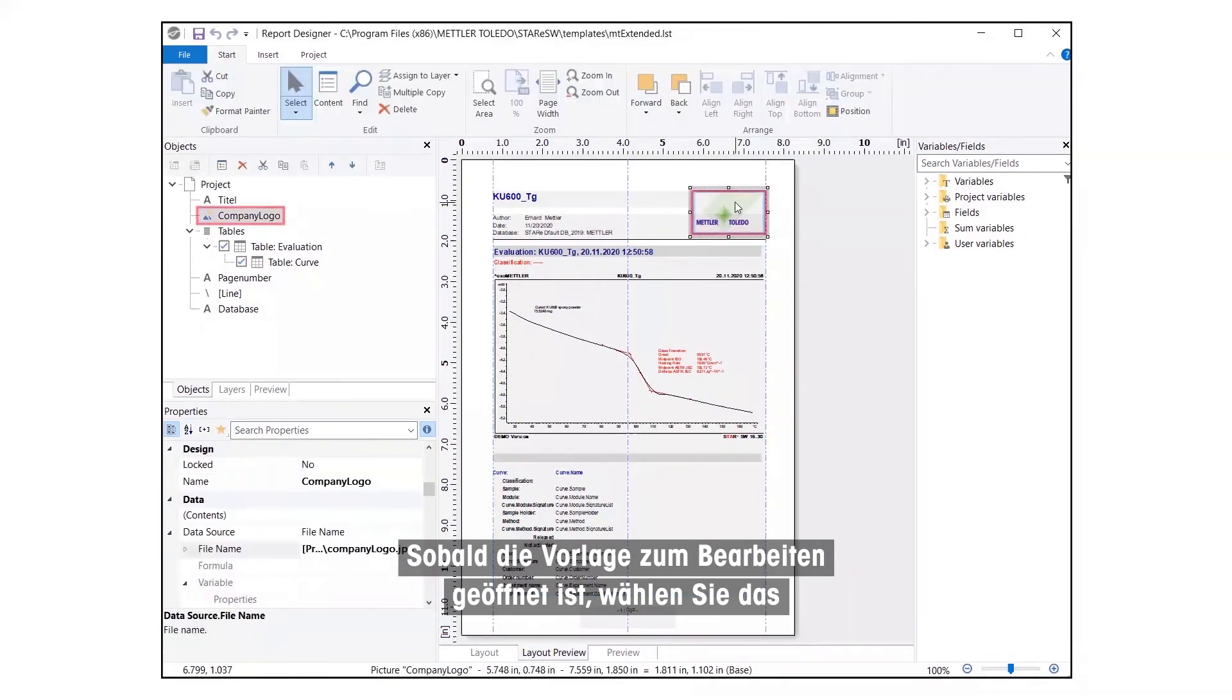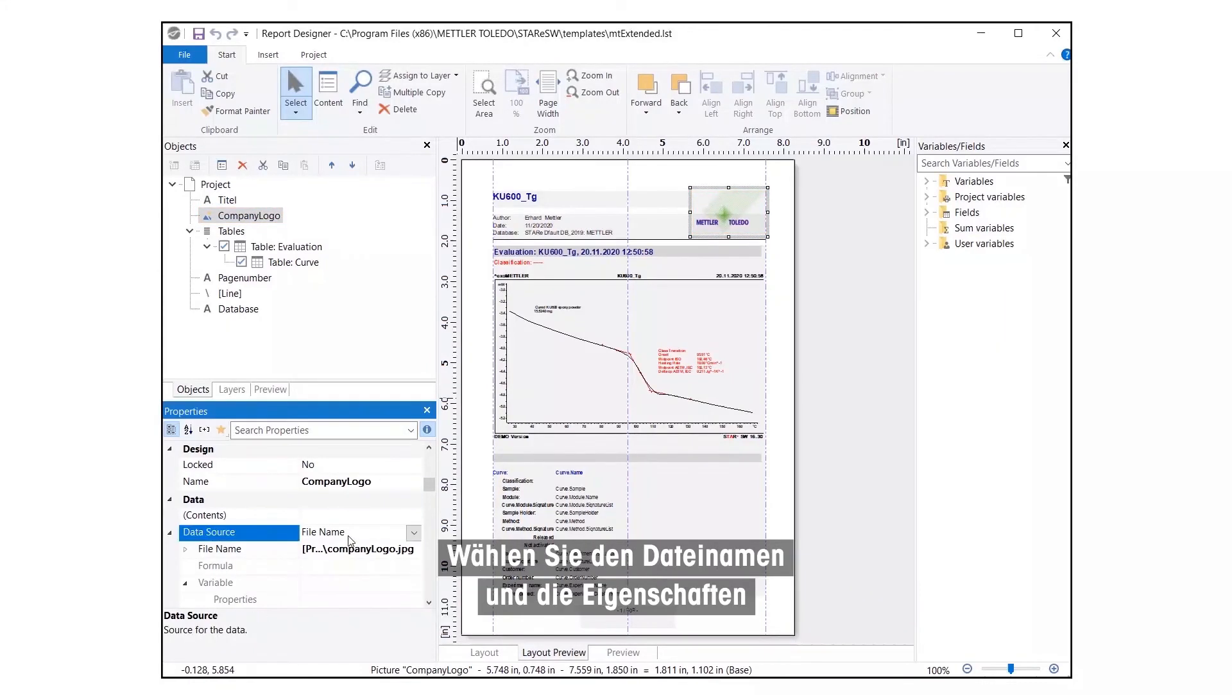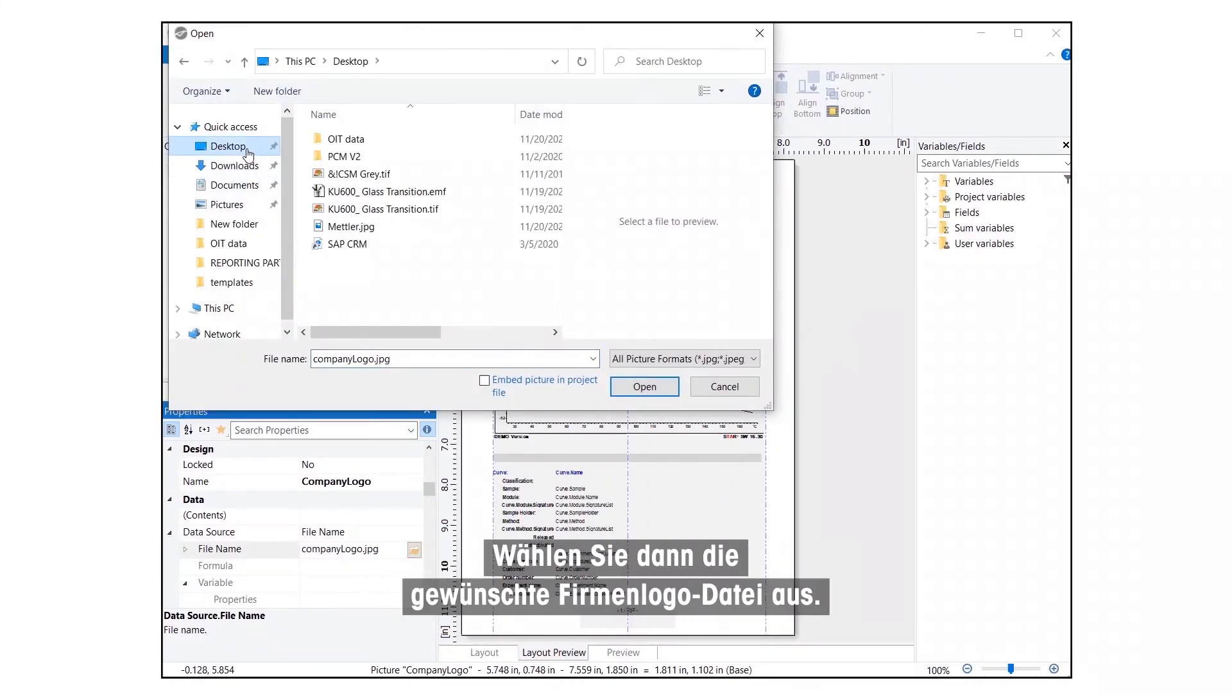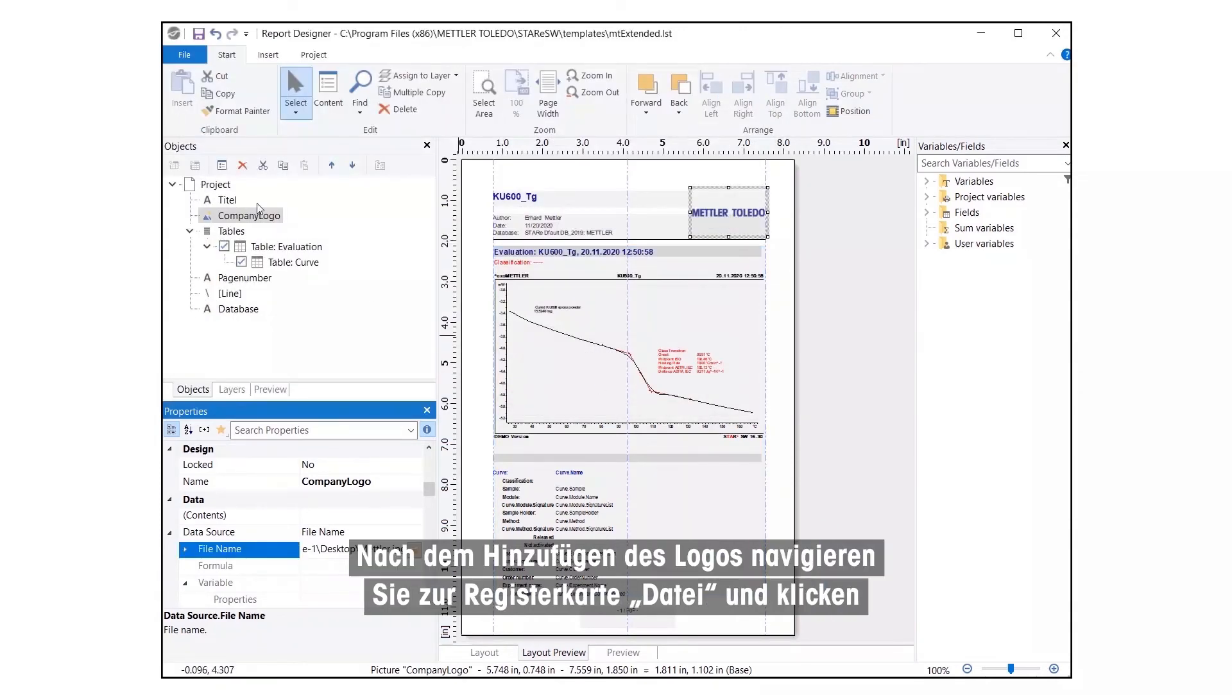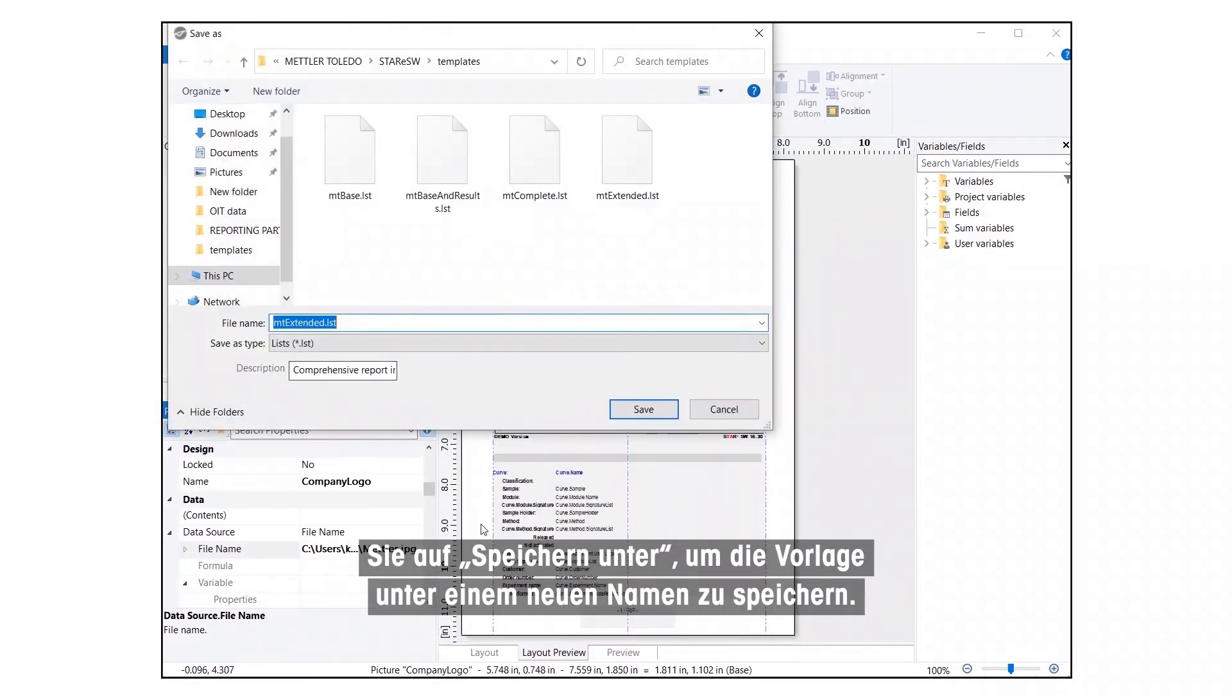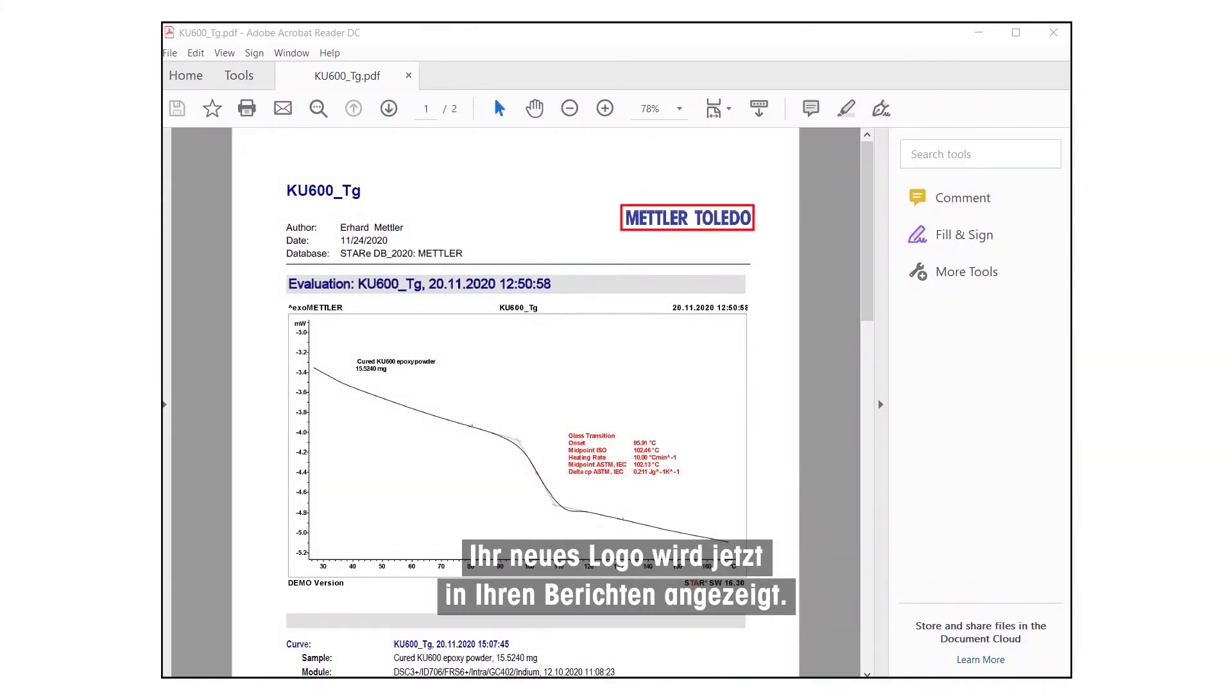Select File Name and Properties and click on the File Explorer icon. Then, select the company logo file of your choice. Once the logo is added, go to the File tab and click on Save As to save the template with a new name. Your new logo will now display on your reports.